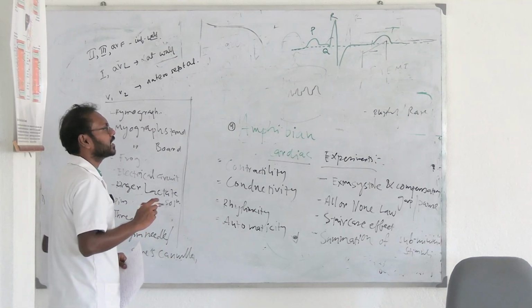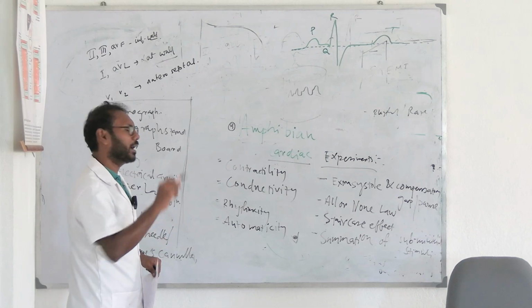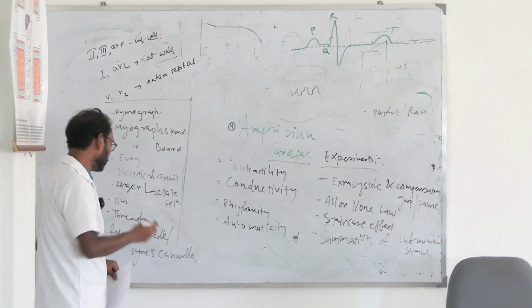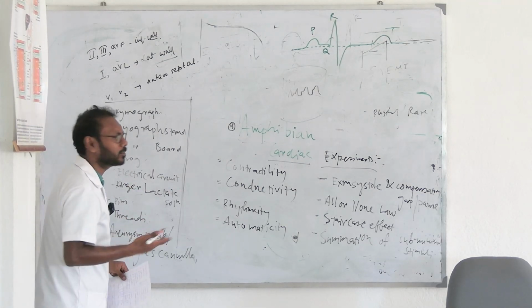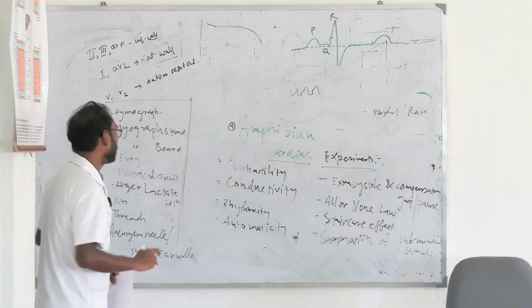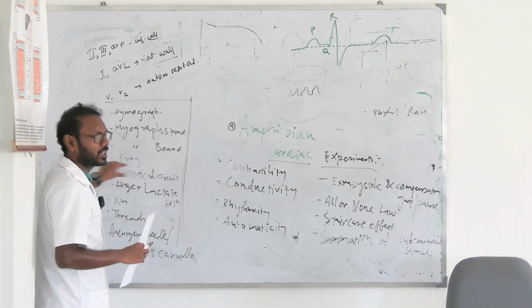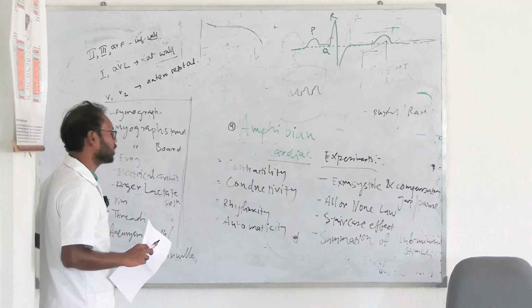Then there will be threads for binding the frog and also binding some special areas. What we will bind, I will tell later. Then aneurysm needle or Symes cannula depending upon the experiments. A cannula is there, a needle is there. So all of these are basic things. We will be adding or removing things according to the test. But these are the basic things you will be needing.